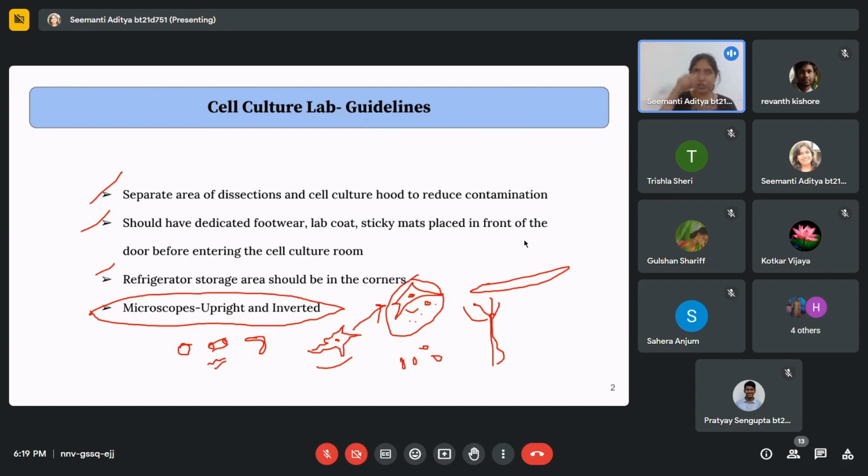Spiral bacteria are going to spiral. Round shaped bacteria will also show movement like this. You can clearly make out whether the bacteria are moving or not, or whether it is a vesicle that is secreted out from the cells. Secreting vesicles is sometimes a characteristic of cells, for cell to cell communication, or some kind of chemicals they secrete that are present in those vesicles.